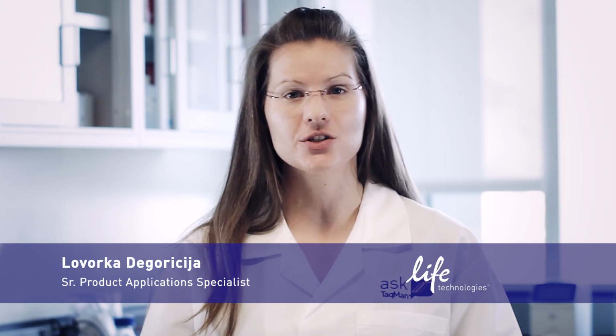Today's Ask TaqMan question is, how can you detect copy number variation with digital PCR? Sounds like an ideal application for the QuantStudio 3D digital PCR system. But before I show you how, first let me give you a little bit of background.